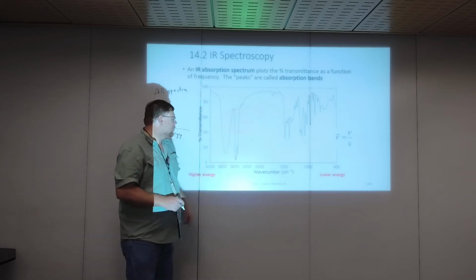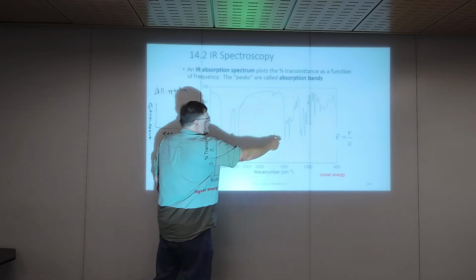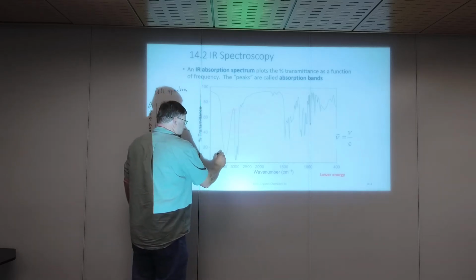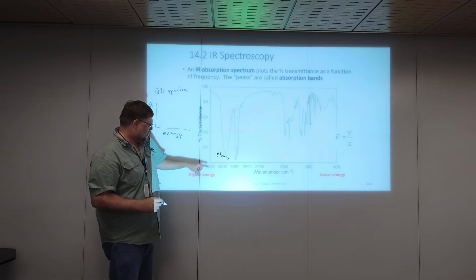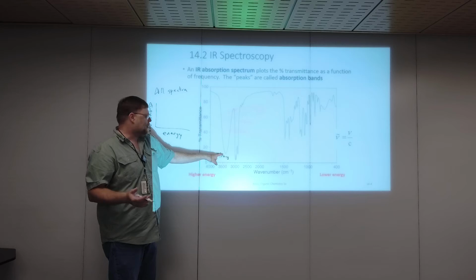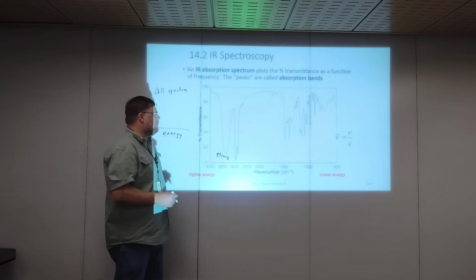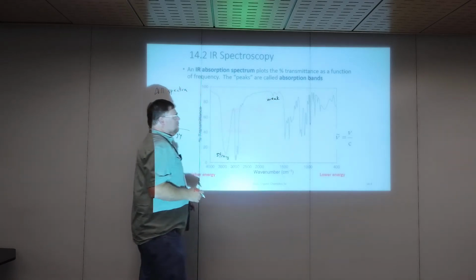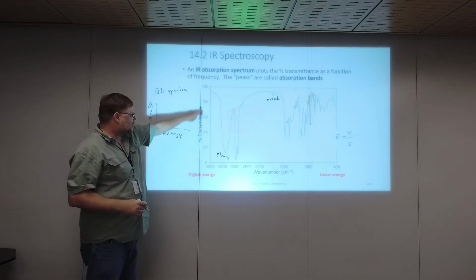As you can see, we've got bands. We call this an absorbance band. Here are some absorbance bands. And this would be strong, because it's really absorbed. It's down here around 15% transmittance, so something like 85 to 90% of the wavelength is absorbed by the sample. And these little things up here would be called weak. There's an absorbance band there, but not much. So that's the absorbance axis.